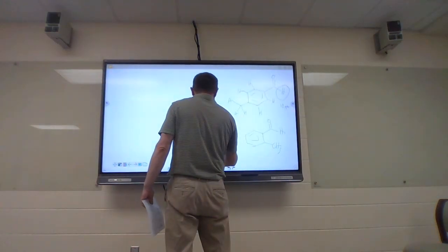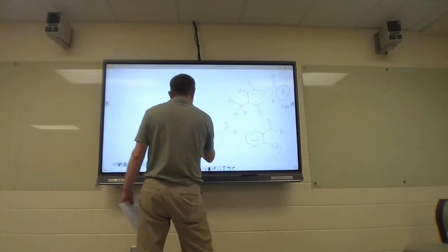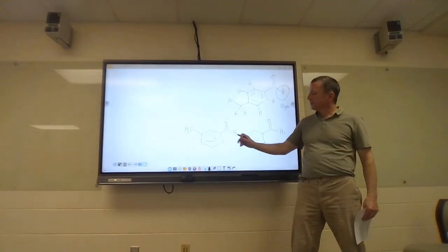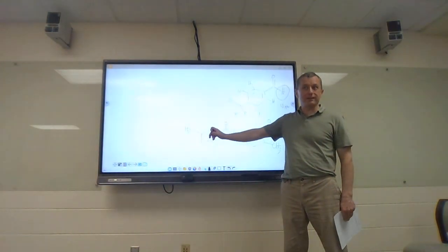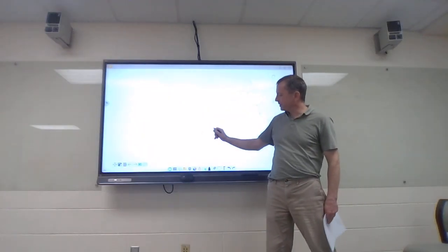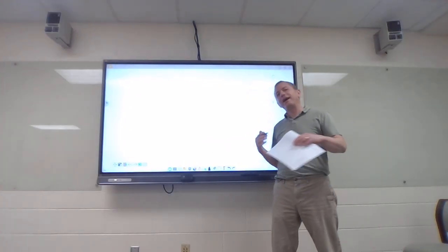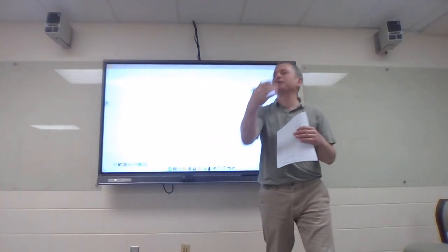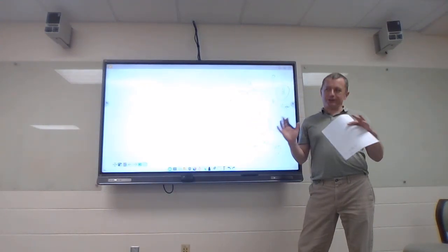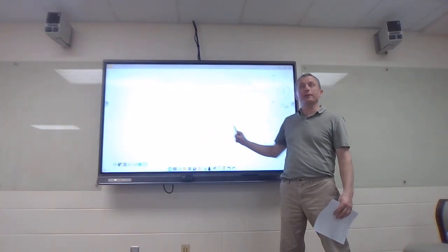What's the other option I have? Now looking at this one, it should show up as a singlet almost. Here's where benzene rings are annoying. Sometimes this one won't be a singlet and it'll actually get split by this one over here. Aromatic rings will tend to go one further than they're supposed to. So again, I would not overanalyze the splitting, but it would look different in the chemical shift.